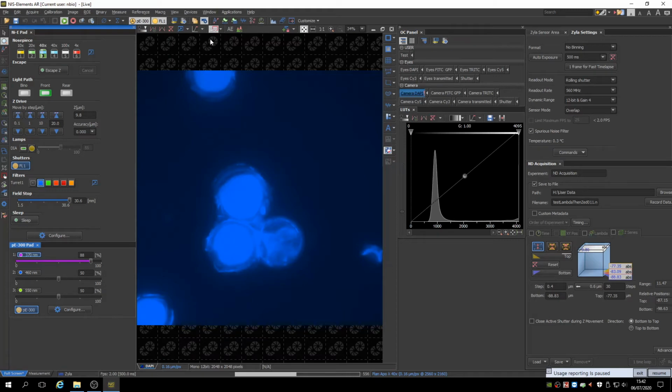There is a button up here which is very helpful for telling you if your image is overexposed or underexposed. By default, overexposed pixels are shown as red and underexposed pixels are bright blue. If you select the arrow next to the button, you can change these default colours. The image here has some overexposure highlighted by the red patches.